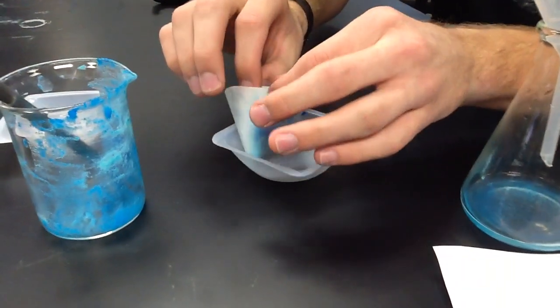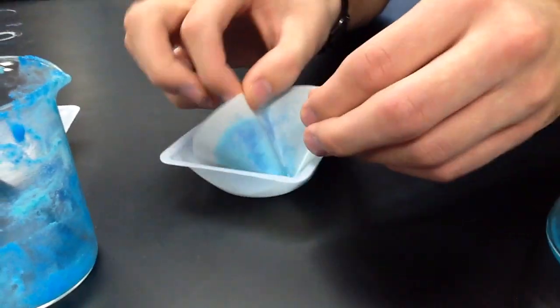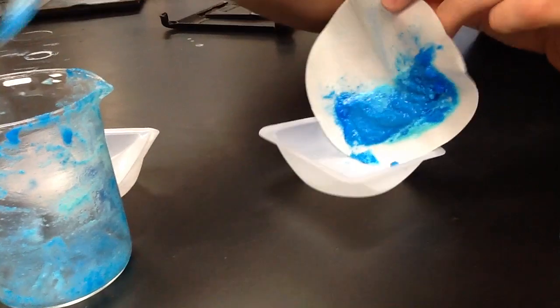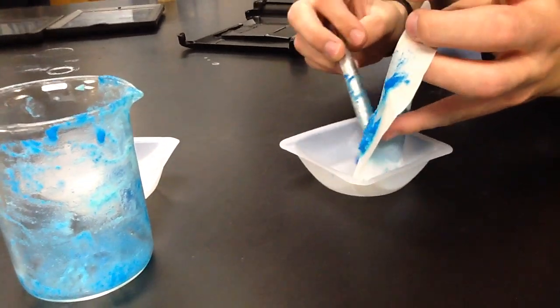Then remove the filter paper and open it. Scrape the remaining product off the filter paper onto the weigh boat.